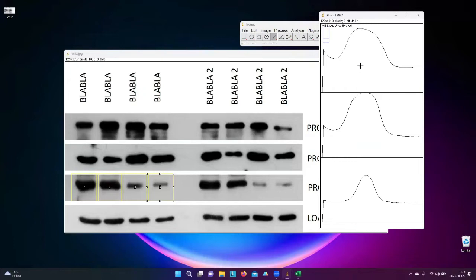So in that case, whenever you are using the baseline correction, which the program automatically gives you these straight segmented freehand lines and arrows, you need to select one which fits almost perfectly on this one. But let's imagine you go further and you just doing something like this.